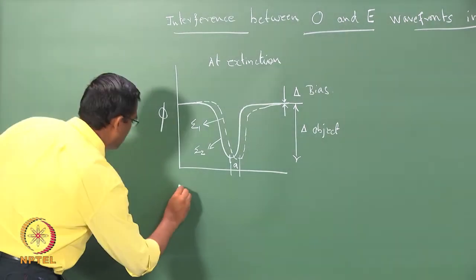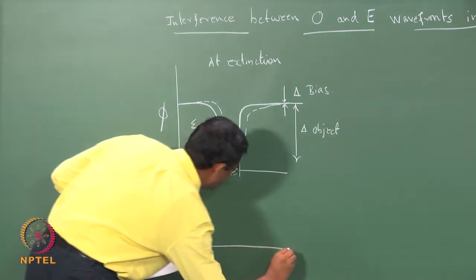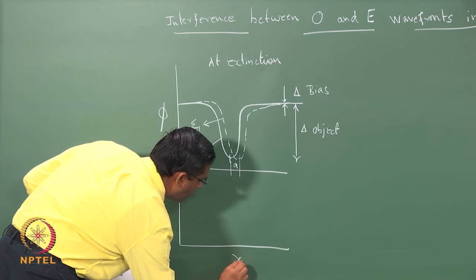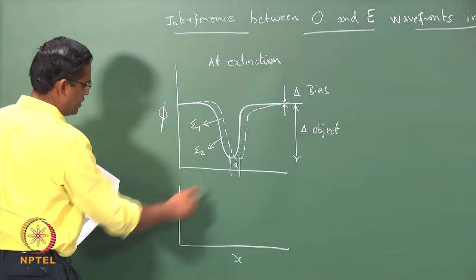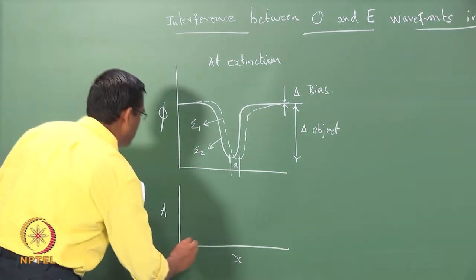And you can see a corresponding phase versus distance, and this is the corresponding amplitude versus distance.